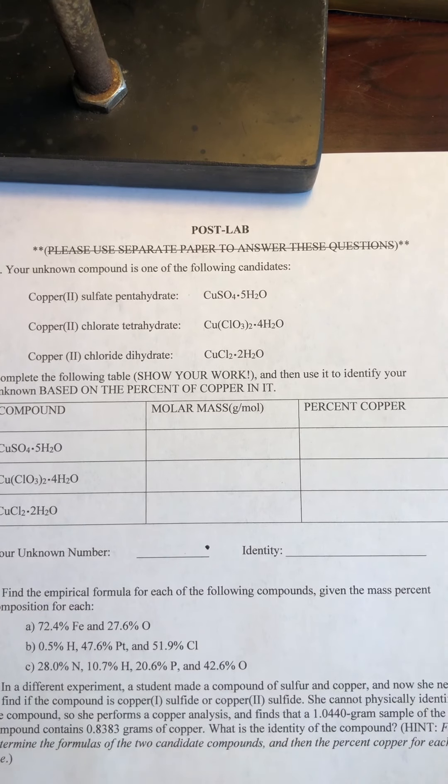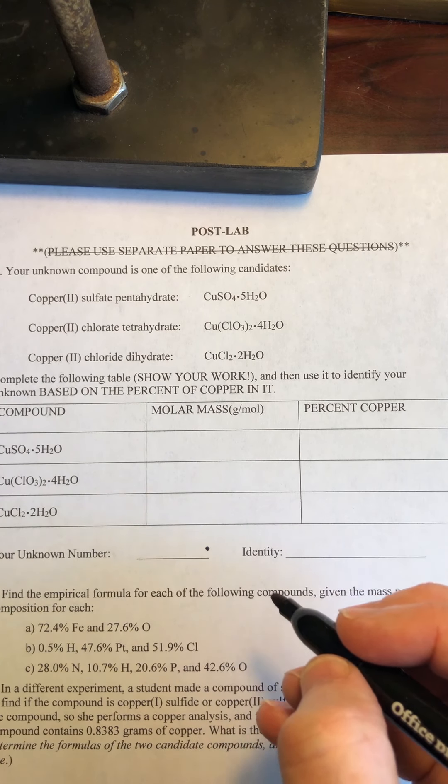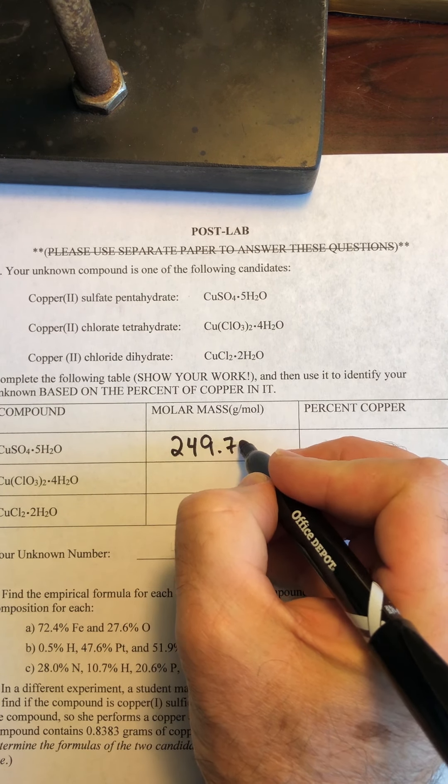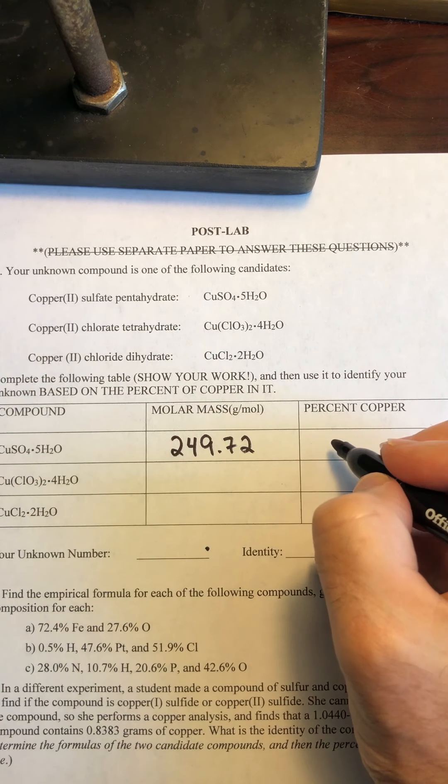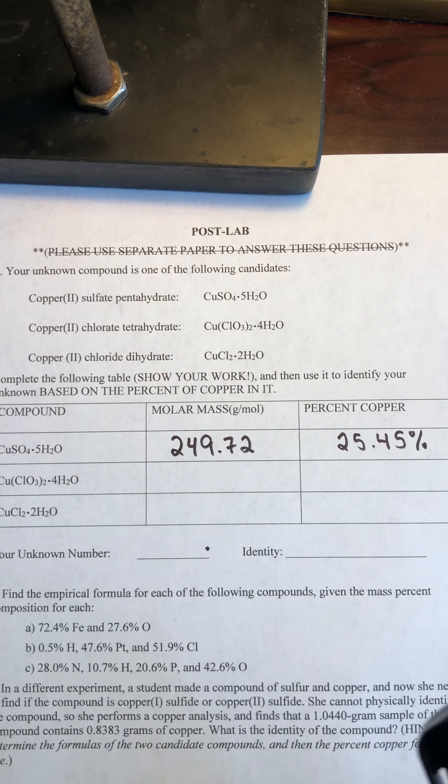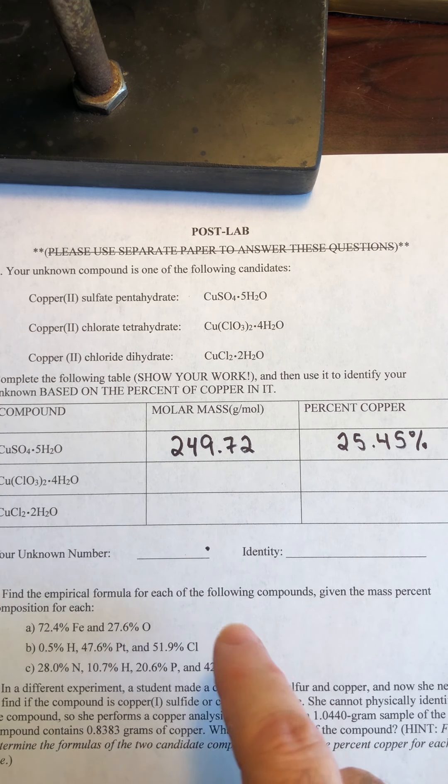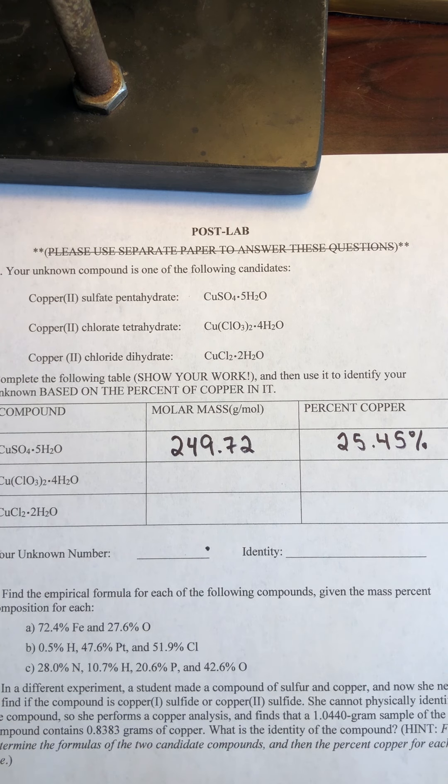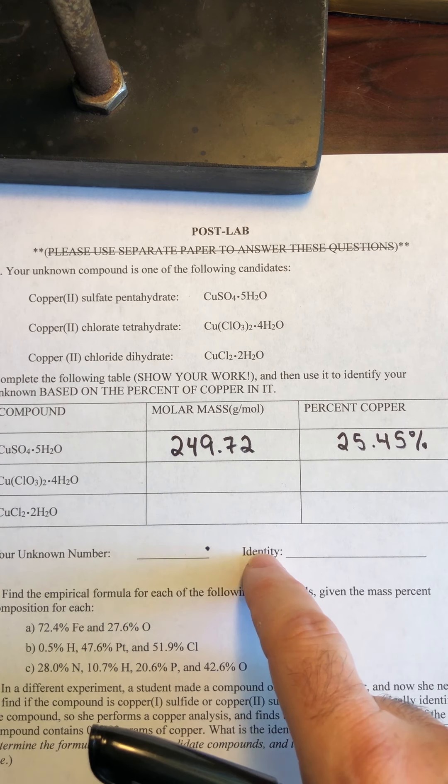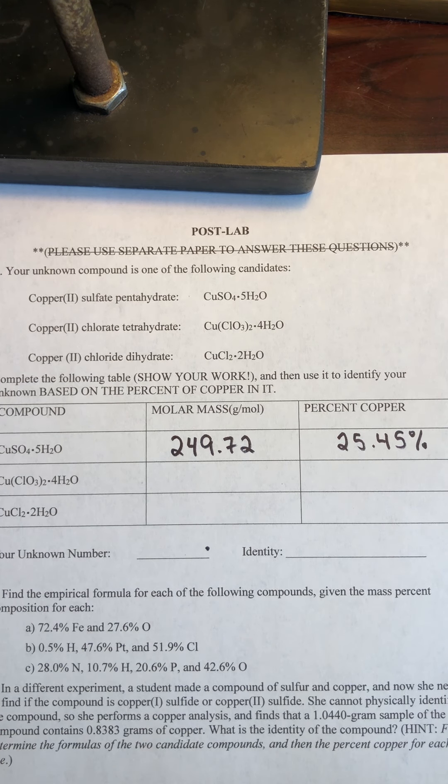And now what you will do is on your post lab page, you're going to fill out this table. We determined that for this first compound here, the molar mass was 249.72. And the percent copper was 25.45%. And now what you will do is you'll have to do the same for both of these guys here. And now based on which unknown you had and what the percent copper was for your unknown, try to see which of these three more closely matches the percent copper that your unknown had.